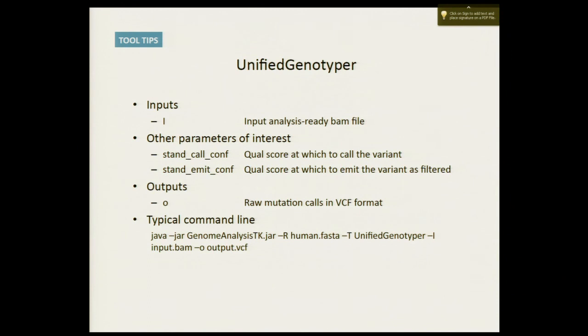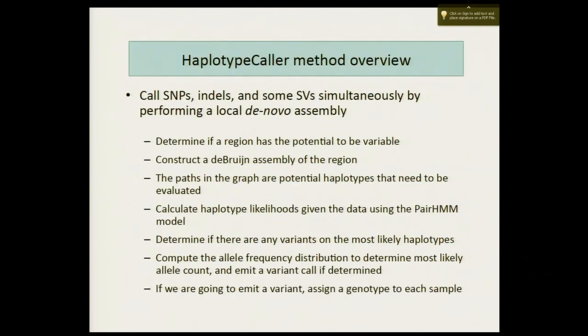Now, as I was saying, this is our standard, older workhorse tool that we extensively use. But it has some limitations. The state-of-the-art tool that Ryan here developed is called Haplotype Caller, that he's going to describe right now, which is the tool of choice for more sophisticated analysis and which is more sophisticated than Unified Genotyper. So Ryan?